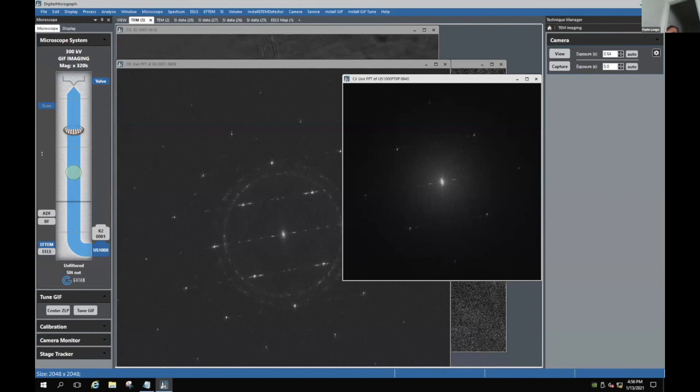In general, it's a little bit difficult to build holders for Thermo Fisher instruments because the rod is very thin. But in the case of the new design, we're getting much better resolution compared to the previous holder. Also, the sides of the dewar are circular, and the dewar is made of a different material, so debubbling is not needed anymore. In the previous version, we had to debubble the dewar, but now we changed the material, so that's not something we do anymore. The hold time is like 8 hours, so I believe once we're able to have the EELS holder double tilt, it's going to be really, really good for atomic EELS in cryo conditions.